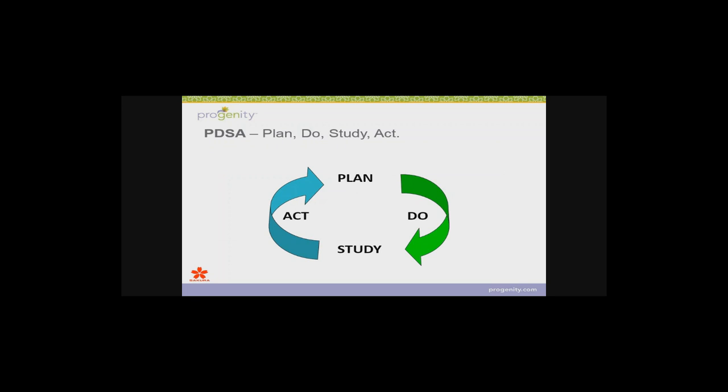So this is the methodology that I advocate. Different arenas, I'm a Six Sigma guy, but Six Sigma talks about defects in parts per million. In histology, we're nowhere near being able to measure that. We're looking at defects in parts per 1,000 or parts per 100. Whether you consider the defect to be bubbles under the cover slip, variability in your H&E or your IHC staining, chatter, holes in your sections, wrinkles. So I find that Plan, Do, Study, Act is a very nice philosophy to be able to move forward in the laboratory without getting too hung up on Six Sigma.